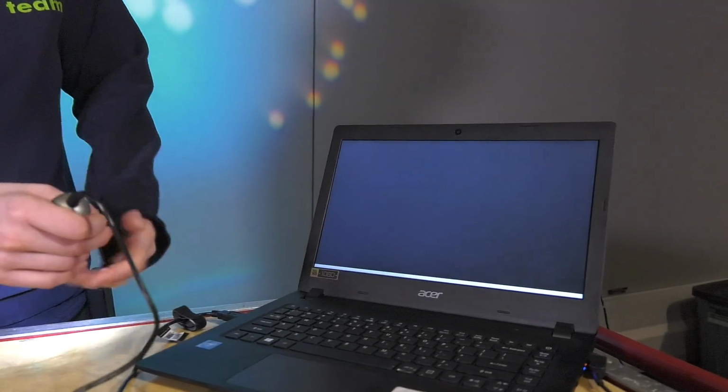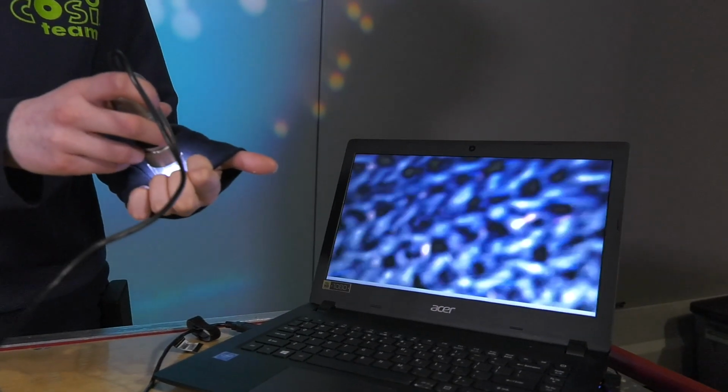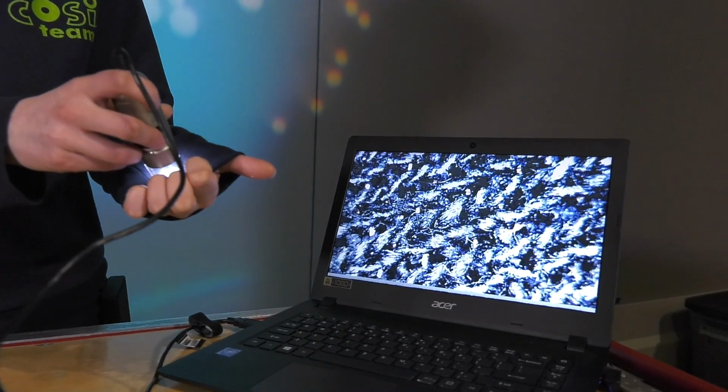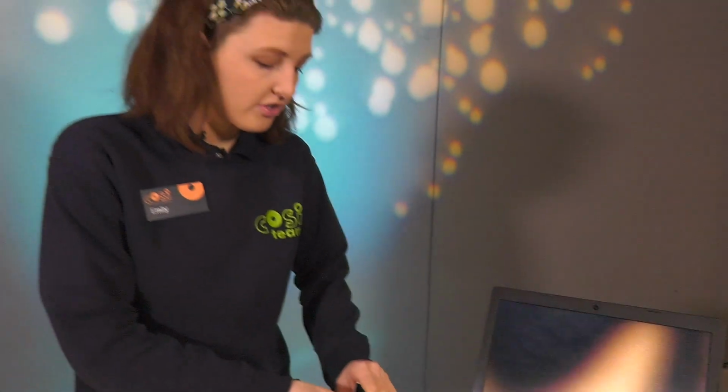Or maybe we'll take a look at my sweatshirt right here. If we hold it up, we can see how that fabric looks, how it's knitted together. Those are just some of the things that you can see with the microscope.